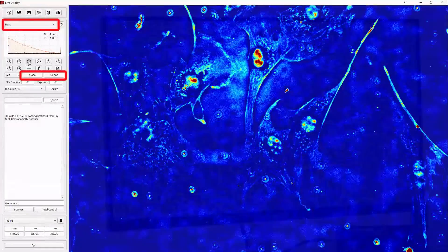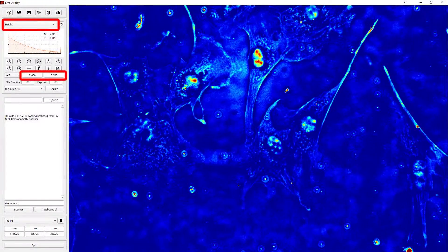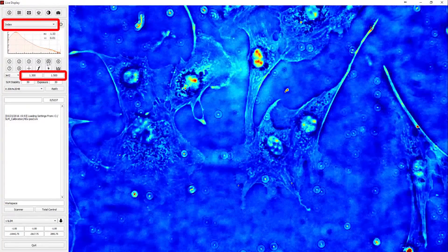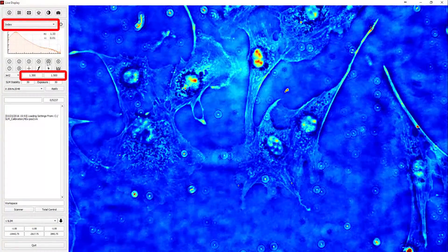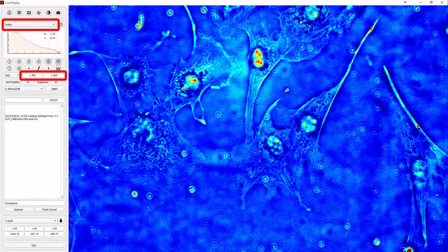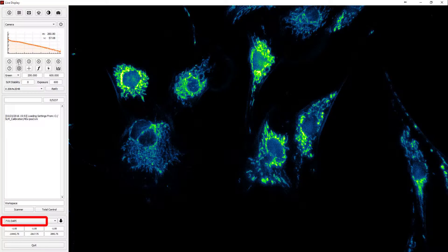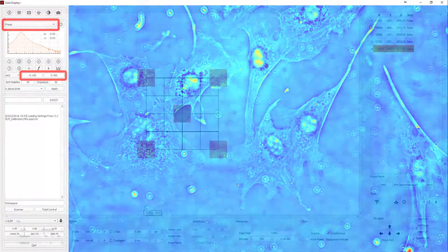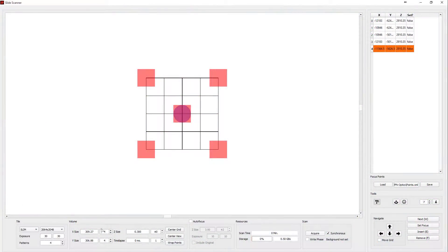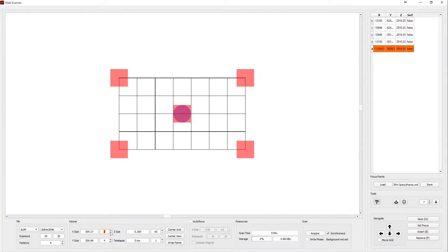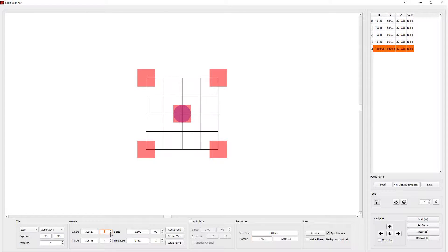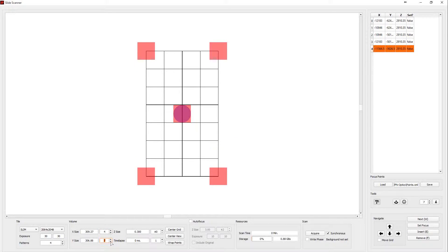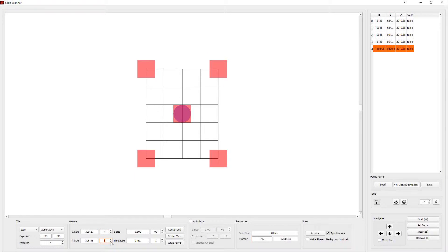The software running on the SLIM PRO model is extremely powerful and it performs many tasks in parallel. At the same time, you will love how easy it is to use. If you want to image a large mosaic, all you need to do is select your objective, set the limits of the scan, and click start.